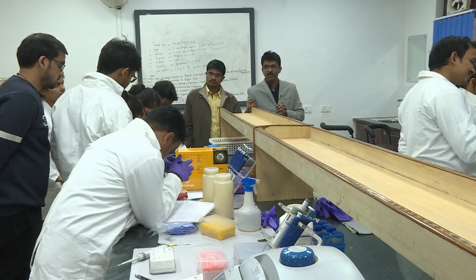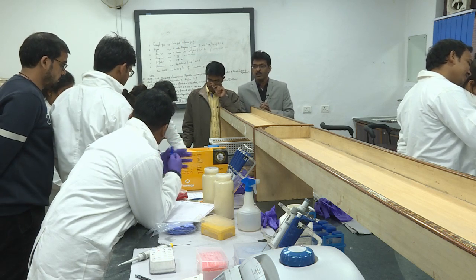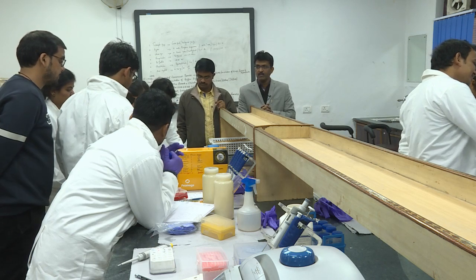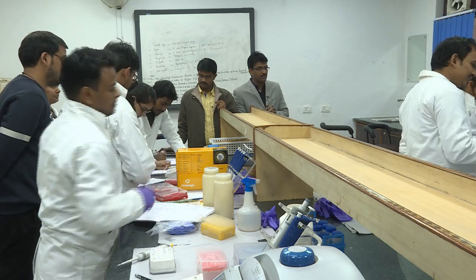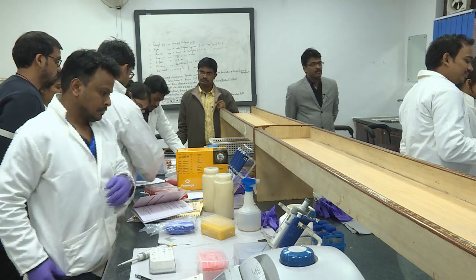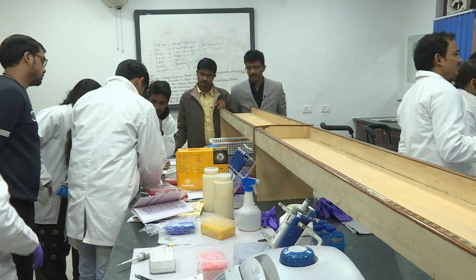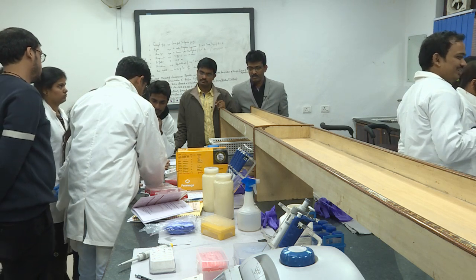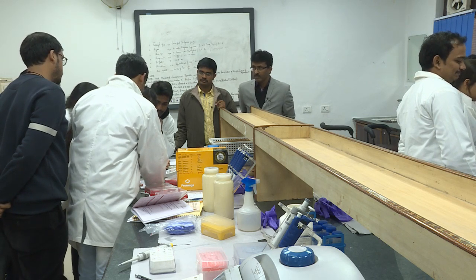Primer forward, primer reverse, PF, PR, PF, PR, PR, you write, that is understood. Then your Taq polymerase, then your DNA. So concentration, I already told all of you. So milli-Q water is like this, we used to write. Like we write C as stock concentration, WC as working concentration, then 50 microliter is our reaction volume. Suppose it is 25, we'll write here 25.